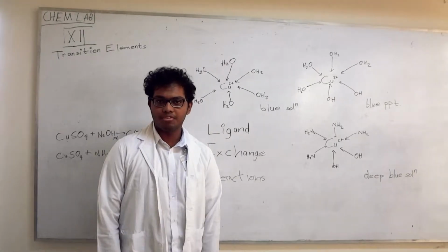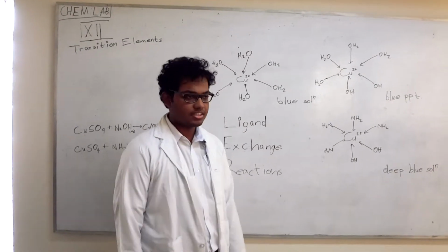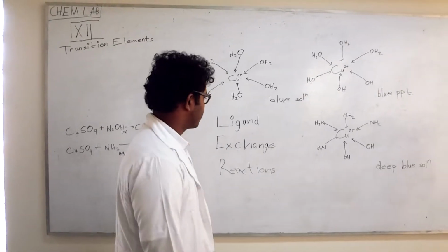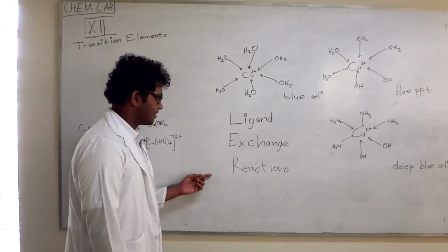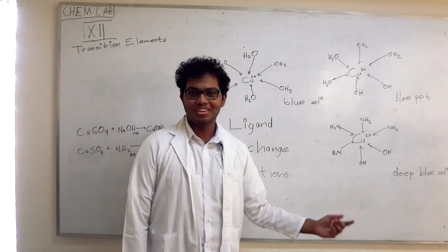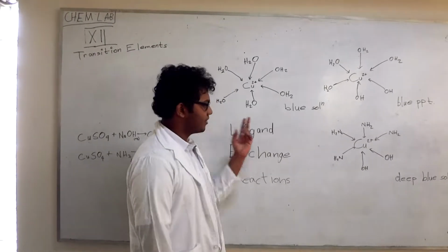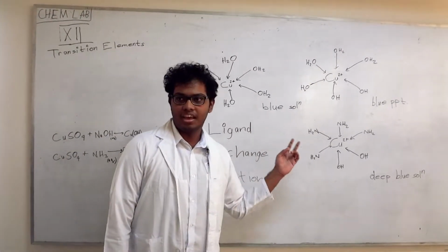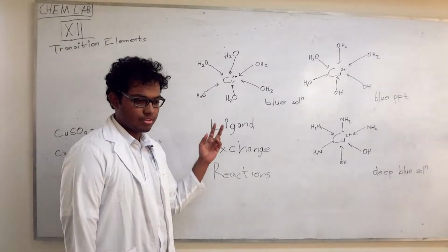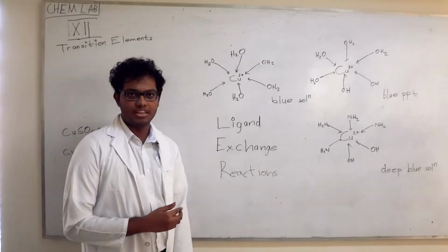Now I'm sure everyone has carried out salt tests at the lab from time to time, but a lot of us don't understand how these tests work. They work because of these reactions. And today my friends are going to show you the reactions, and then I can explain how the formation of different complexes affects the formation of precipitates and how you can use them to identify salts.